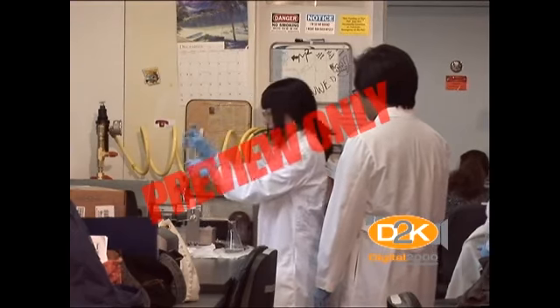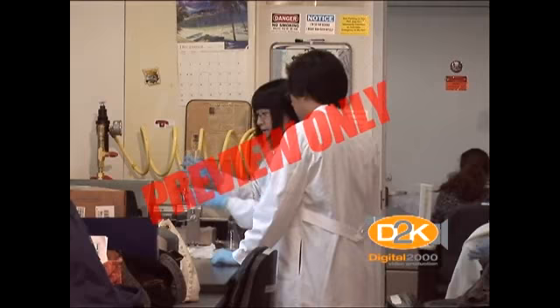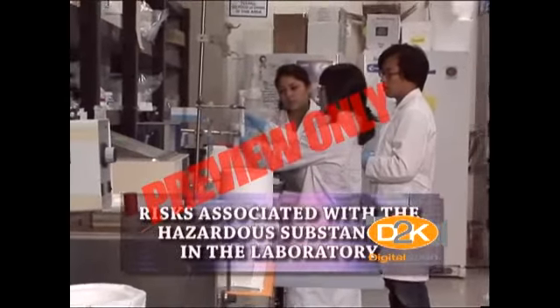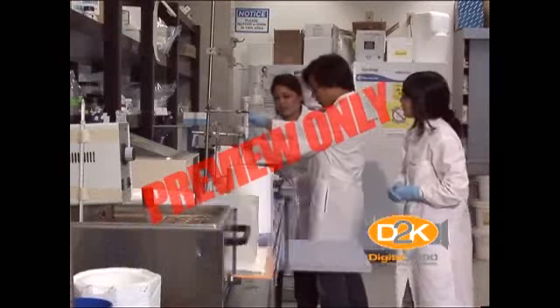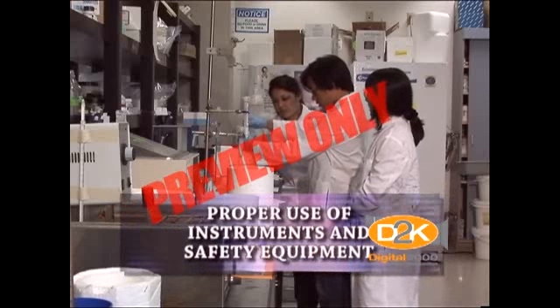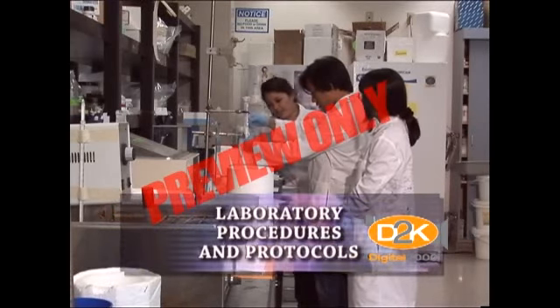In addition to general training, you must receive training specific to the laboratory in which you work. This training must include such topics as risks associated with the hazardous substances in the laboratory, physical hazards present in the laboratory, proper use of instruments and safety equipment, and laboratory procedures and protocols.